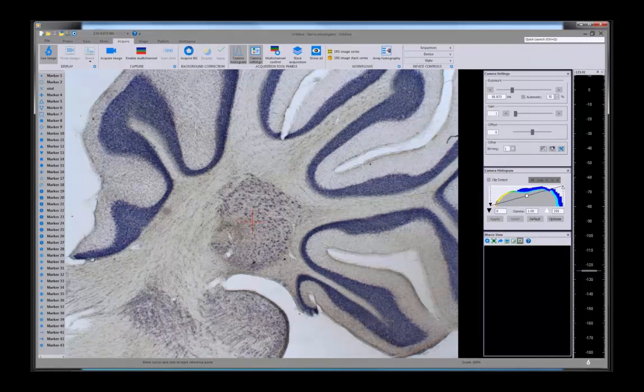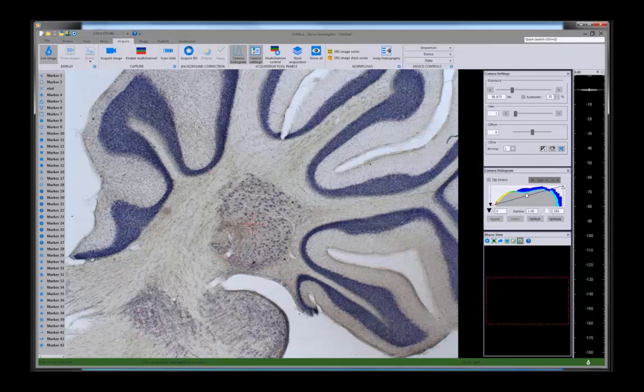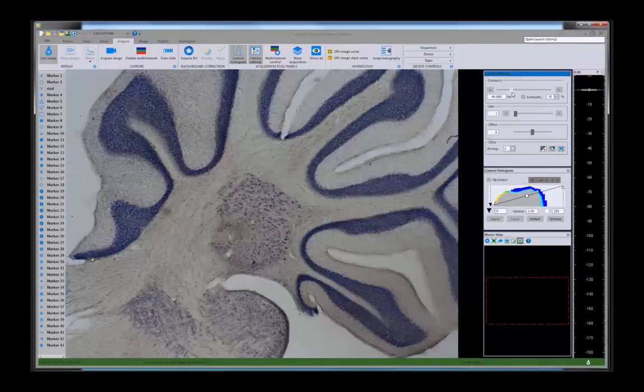And if we look down here, it shows the coordinates x, y, z. And if I can do this right, I'm going to get right in the middle of the origin and at 0, 0, 0 on the lower left. So that's x equals 0, y equals 0, z equals 0. Everything that you trace is in reference to that point. I'm going to make this a little darker so we can see the tracing a little better.